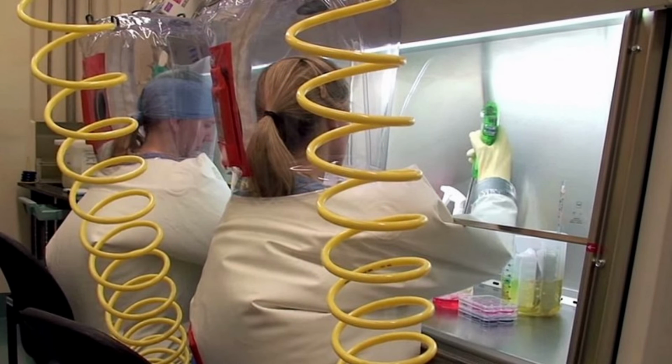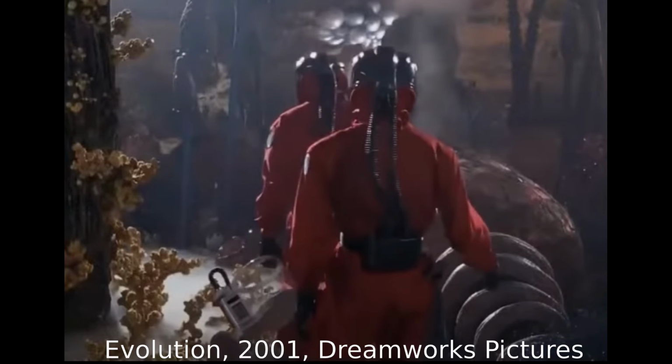One of the first and most obvious requirements if you find yourself in one of these facilities will be that you need to change your clothes before you can enter the facility. This ensures that what goes into the facility stays in the facility except for yourself. You and any materials you may have with you will also be required to undergo decontamination. For yourself, this may be as simple as showering thoroughly.